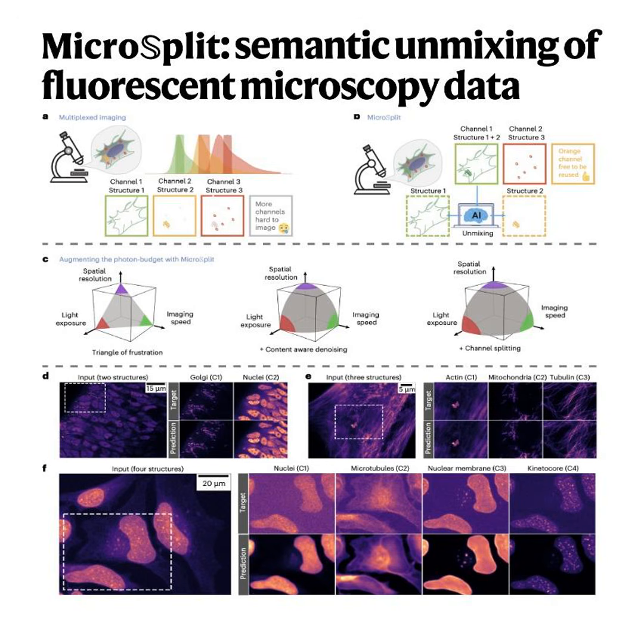right? Yeah, or you do the opposite. You crank up the laser to get a perfectly clean image, and you induce severe phototoxicity. You just cook the cell. Literally, you end up altering the very cellular biology you're trying to observe, or you just kill the subject entirely. So we're stuck in this frustrating loop. We want richer multi-target data, but doing it sequentially either leaves us with garbage data or a dead cell.